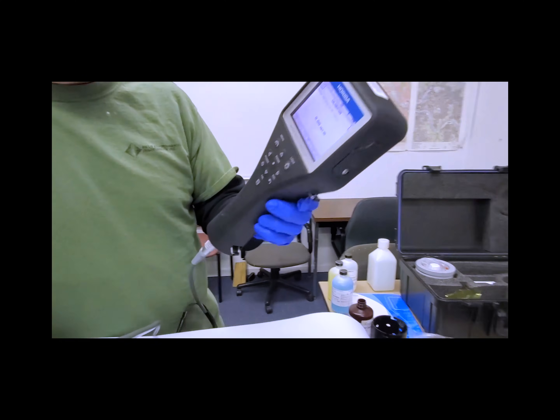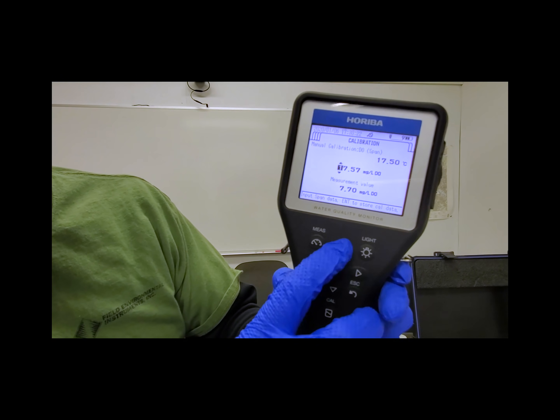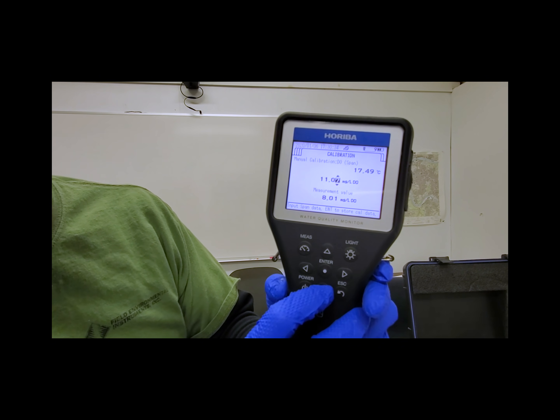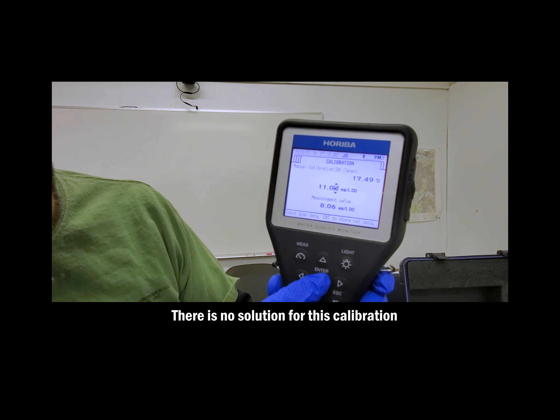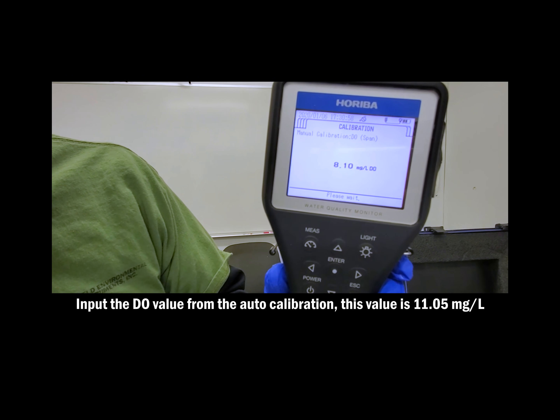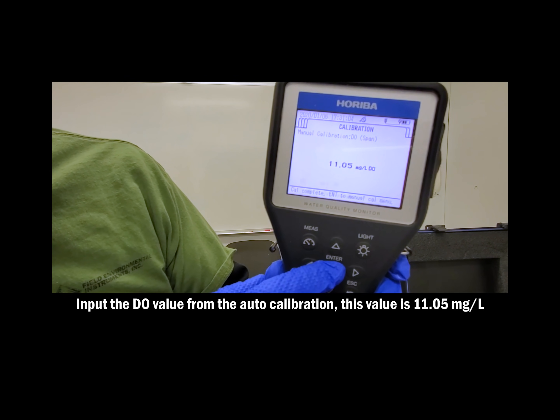The final step in this calibration process is to do a dissolved oxygen open air calibration. We need to do this because the dissolved oxygen sensor doesn't necessarily touch the solutions at all times, so we're going to do this without any solutions. Simply take the value that you wrote down at the very beginning of the calibration process and input it into your value. This one is 11.05 milligrams per liter, but yours can definitely be different. Once your numbers have stabilized, press ENTER, and your calibration is complete.